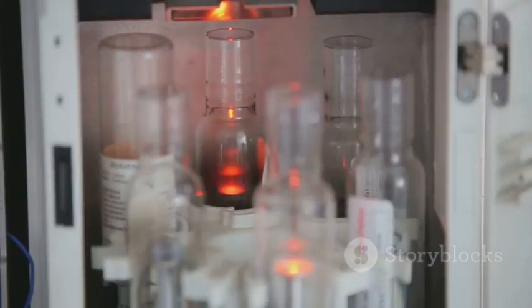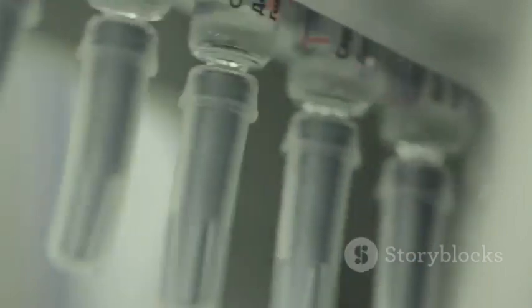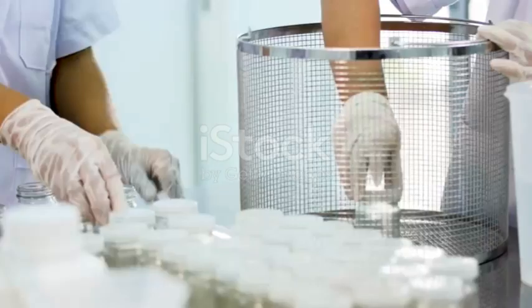So whether you call it a diffusion test or a forward flow test, you are performing a highly sensitive and quantitative check on the filter's integrity, ensuring it is fit to produce safe and sterile medicines.